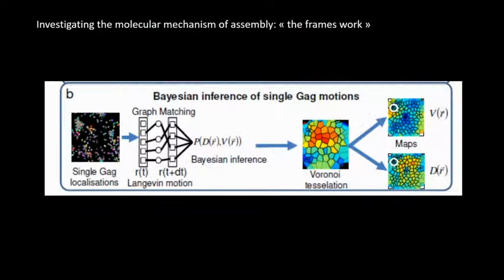So we performed that approach, and we divided the trajectory into two types of motion using the Langevin equation to describe the motion.